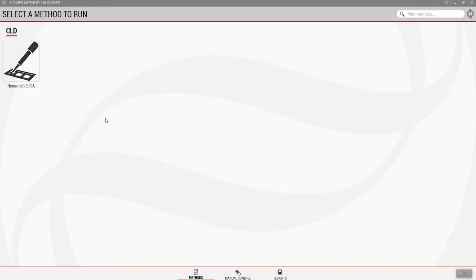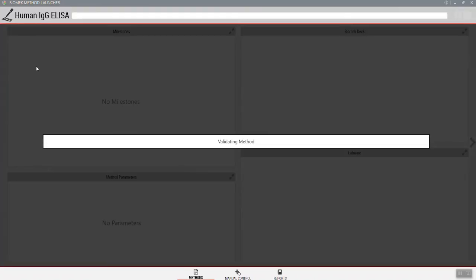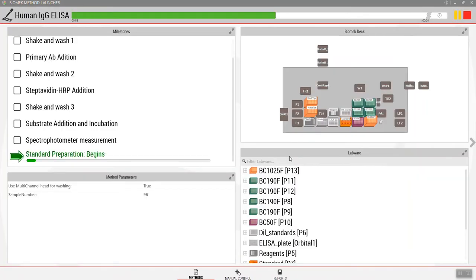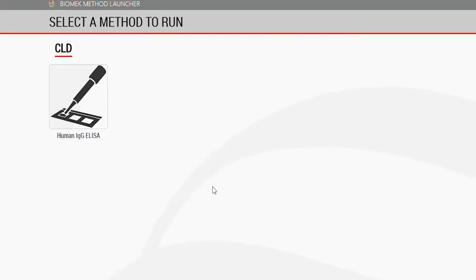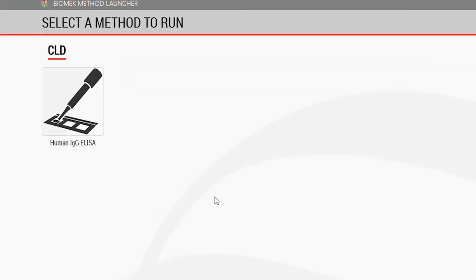Biomek Method Launcher is a simple user interface that enables even novice users to harness the full power of Biomek liquid handlers. It lets you organize and run methods using the app-style launch screen.